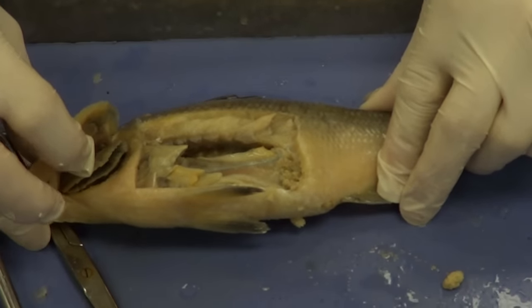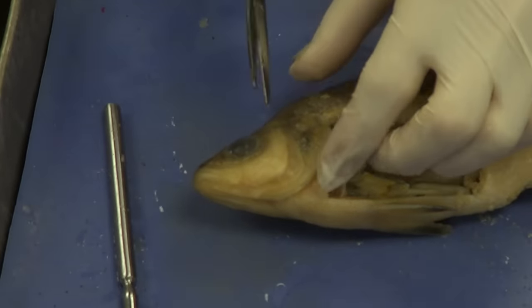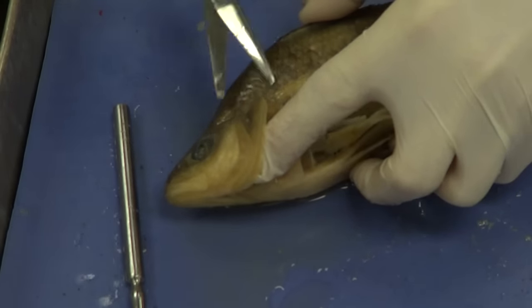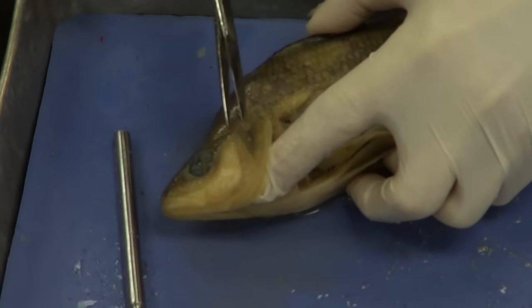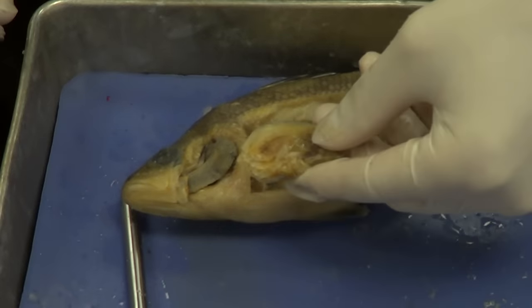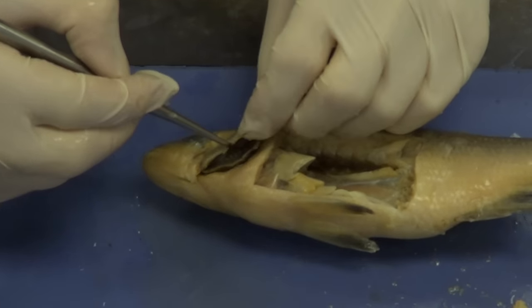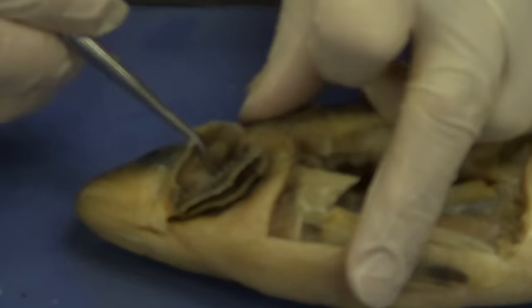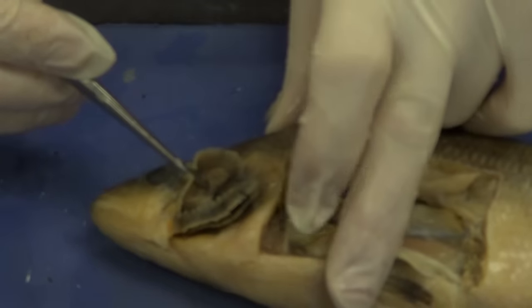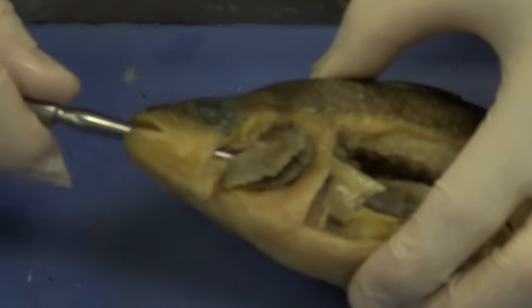I'm going to cut this operculum off — I'll open it up and get in with my scissors carefully. I just want to cut the operculum off without damaging the gills. There we go — this is the operculum I just cut away. Now we can see the different gill arches — there's one, two, three. If I pull these back, you can see little tooth-like structures — those are the gill rakers. They actually separate the gills so that water can move effectively between them for gas exchange.